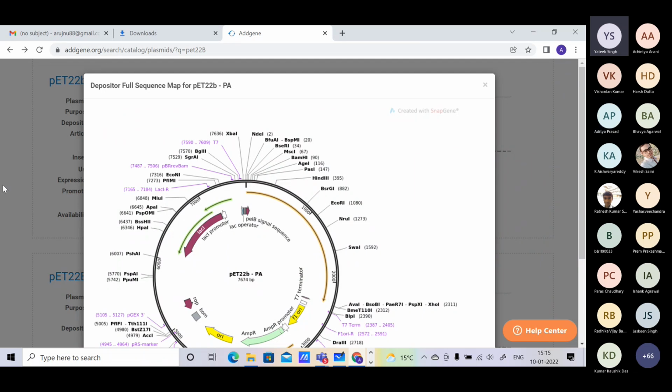And then if you have 2%, so how many of these are... If you have 10 to the power 5, 1% means 10 to the power 3, and then 2% of that, I think it's 20. So now you will get 20 cells on the plate which will now divide individually and make up a colony. So each colony represents an individual cell that has divided multiple times in order to make a colony, right? So roughly 20 colonies means 20 cells have survived the whole process you have done.